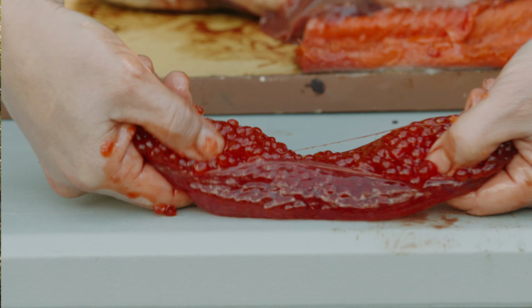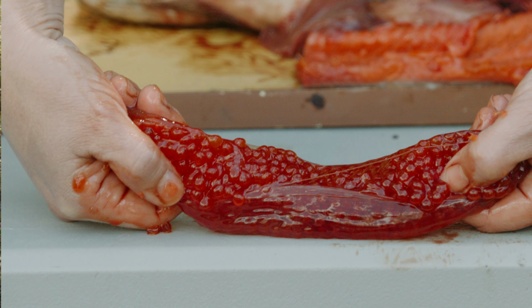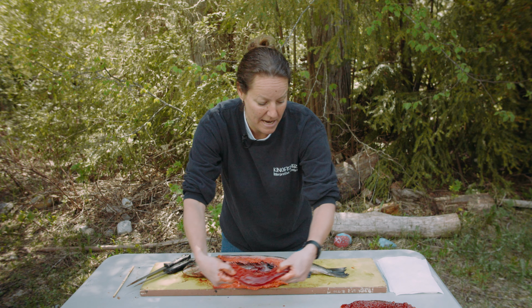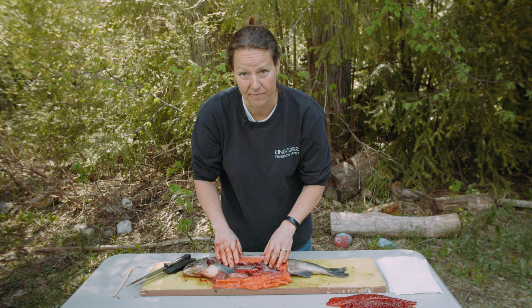And there is the second skein of eggs. And this one's a bit bigger, so I'm guessing there's probably about 1,500 eggs here. So salmon lay a lot of eggs. They have a lot of babies because salmon are a very important part of the food chain.